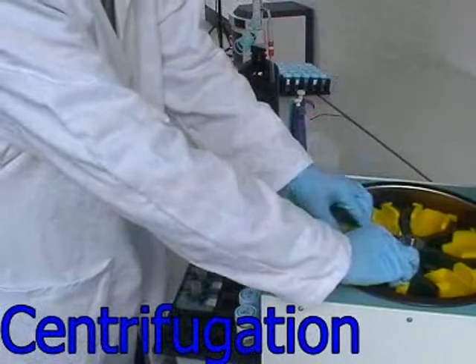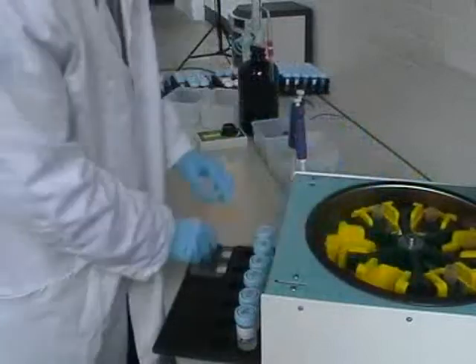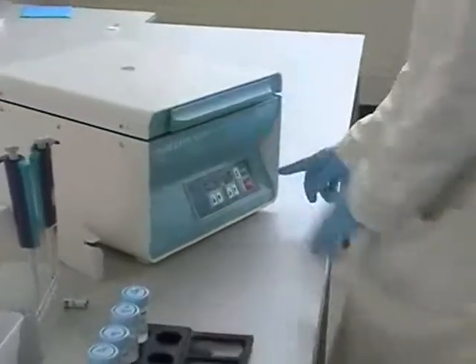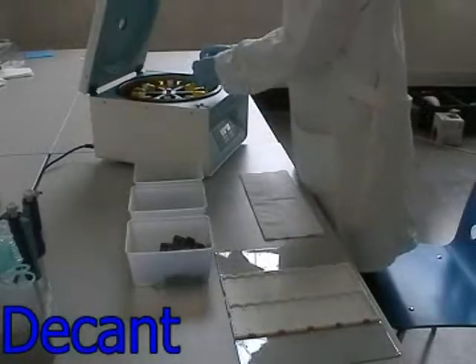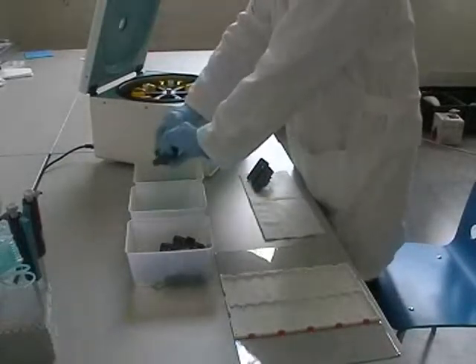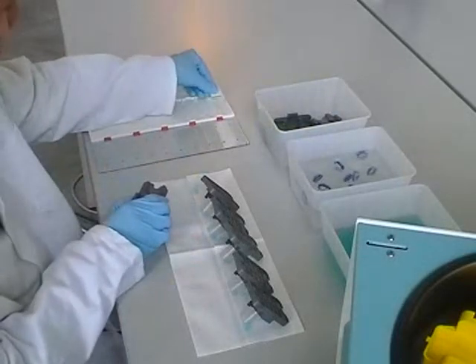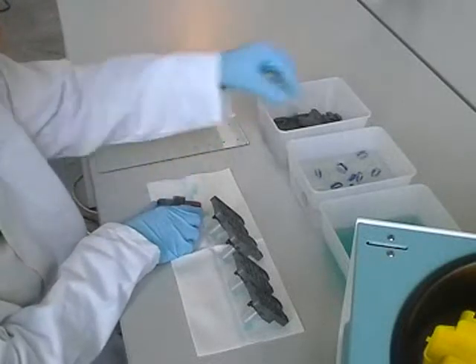Six slides are now ready for centrifugation, which takes 10 minutes and allows you to prepare the next run. After centrifugation, decant the supernatant into a container with disinfectant. Disassemble all the parts, place the cytochamber in a container with disinfectant, and put the slides in the LaboNor flip top to dry for 5 to 10 minutes before the staining process.